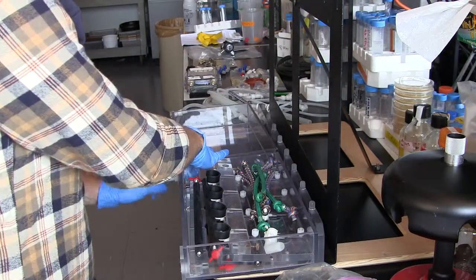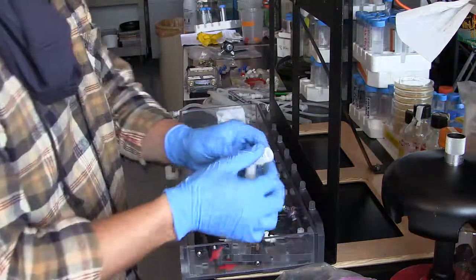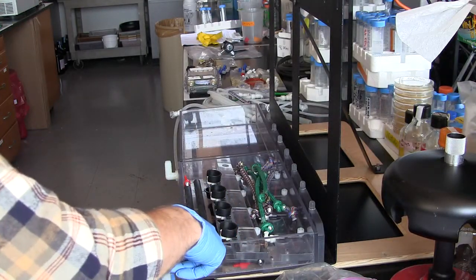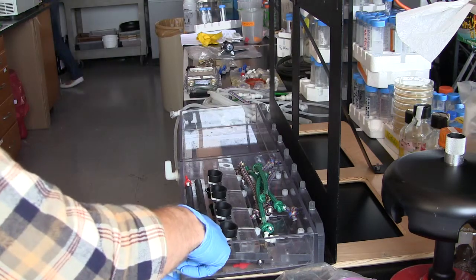Putting plumbing tape, Teflon tape onto these helps them to stop leaking. You can see there's some Teflon tape on here. Normally I would replace these, make it nice new Teflon tape, especially at the start of a cruise. And then once they're screwed in, you leave this water chemistry set up for the cruise, and it doesn't leak throughout the time.